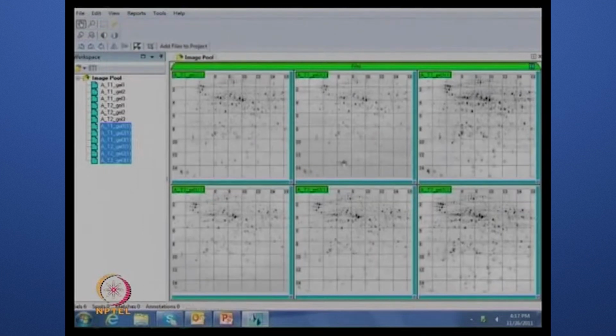processed images. One can create a grid line on the gel. Okay, from the view option they can create the grid line, so that one can easily judge whether all gels are showing reproducibility or not, in which grid I have what number of spots, and so on. It will also help to decide which landmarks one needs to use, as well as which areas one really needs to tweak different parameters for. Exactly, this is a very helpful tool again.